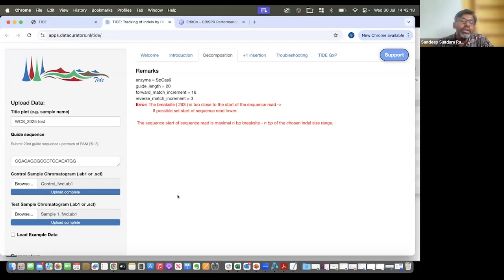In terms of delivery of Cas9 and cell line, in cancer cell lines, I would expect the guides to be efficient above 70%. That's something that can generate a double strand break, and you can use it for knock-ins, knockouts, whatever. For difficult cell lines like iPSCs or embryonic stem cells, a good guide would still be at least 40 to 60% efficient.